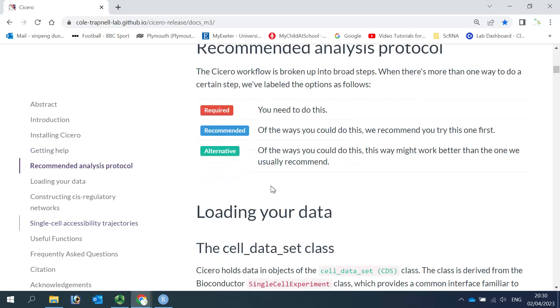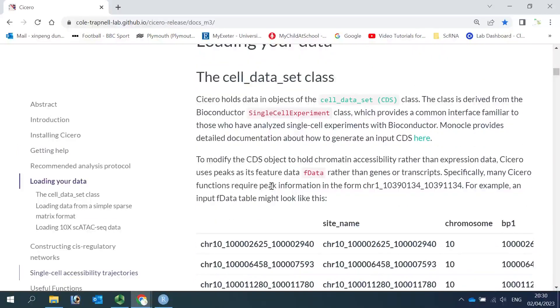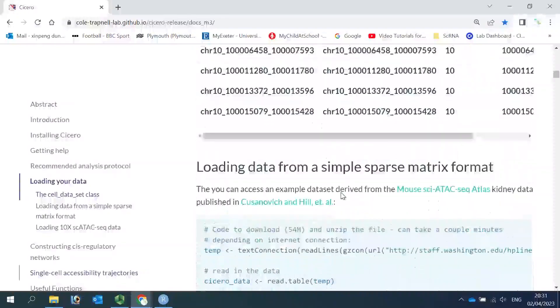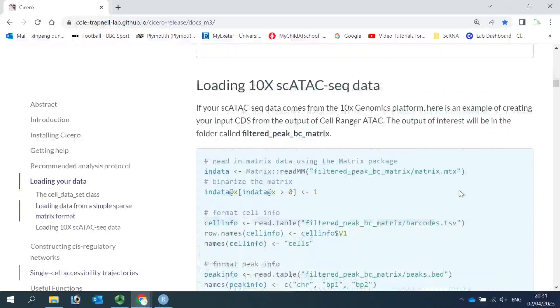The next step is to load the data. Because Cicero extended the package to Monocle3, we will be using the CDS data object. For ATAC-seq data, the features are peaks. For today's demonstration, I'm going to use two sets of data to show you how to load the data into R. First, I'm going to show you how to load the data from the 10x Genomics platform.